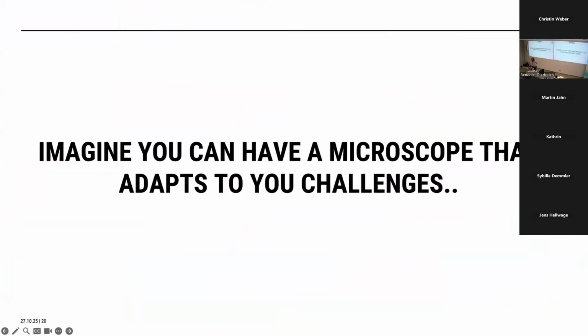But this is only the cube thing. So you will experience how to use these cubes once you get your fingers dirty, let's say. And for this, there's also an open source documentation, which I will go into a little later. But you may ask yourself, okay, there's this cube, it's very nice. It's maybe nice for kids. You have, for example, a little magnifying glass, and you can use that for maybe a little smartphone microscope. But how could I use that for research?